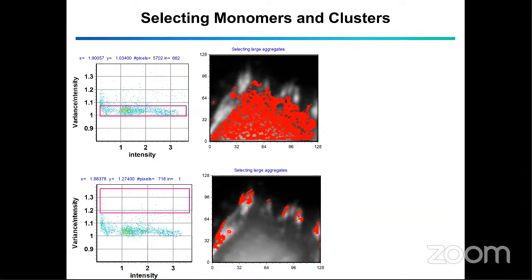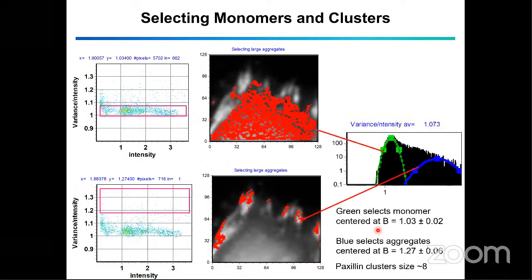And the reason is, once the molecules get incorporated in those focal adhesions, then those molecules cannot move anymore, which means they become invisible to the number and brightness method. They just become this apparent brightness of 1 as an immobile fraction. But these larger clusters, while they integrate, they still move. And this is why we find these high variances near or around these adhesions, and only as they form or disassemble. So for example, when the cell moves.